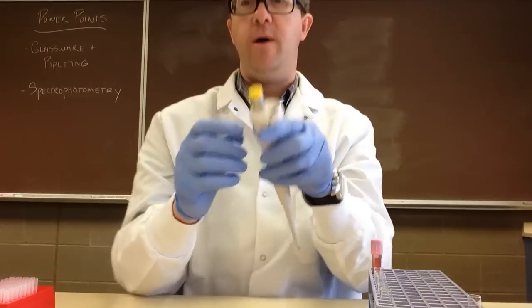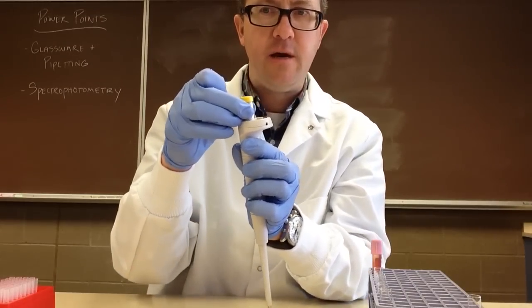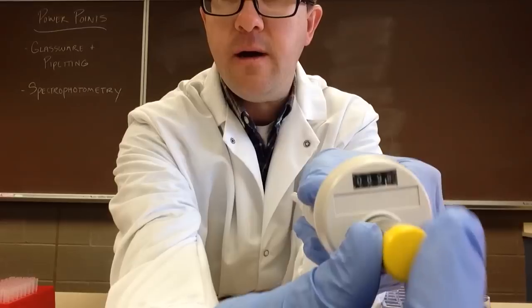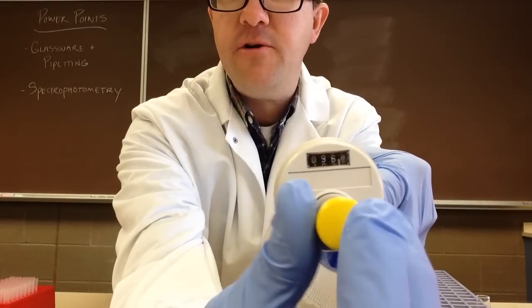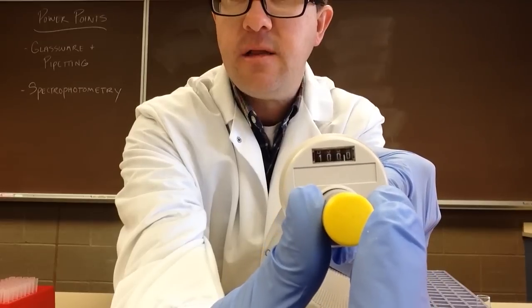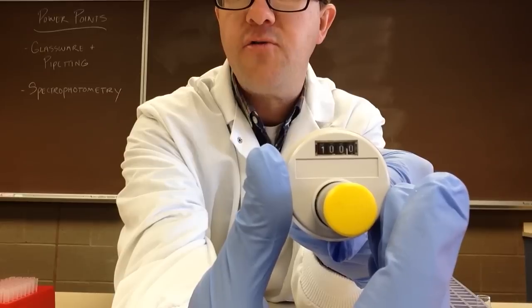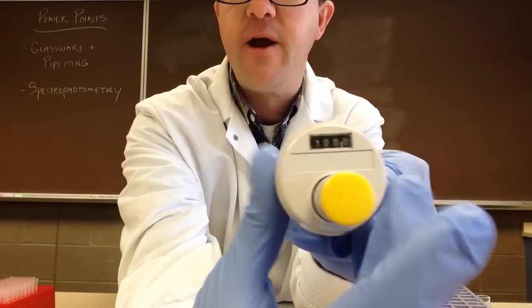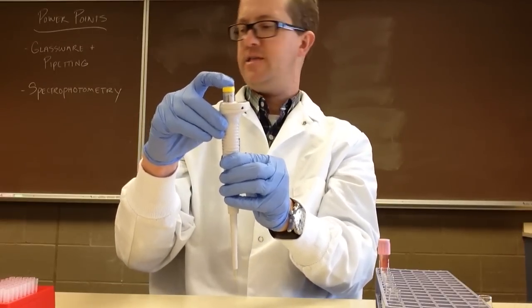For adjusting this one, what we're going to do is gently pull up and there'll be a little click. Then we can adjust it to what we want. You can see there's a comma there. On this particular micropipetter — this is the 10 to 100 — this is 100.0 microliters. Now we're going to go ahead and just put that back into place.